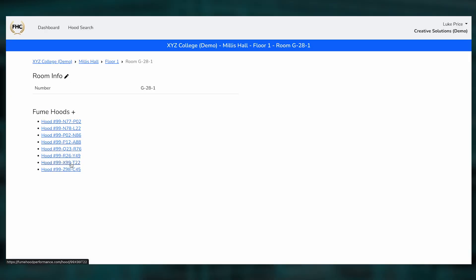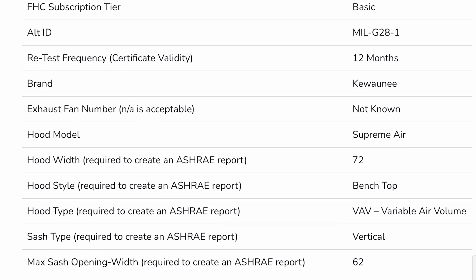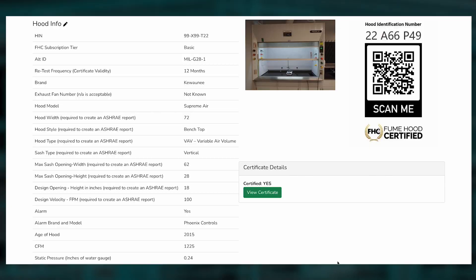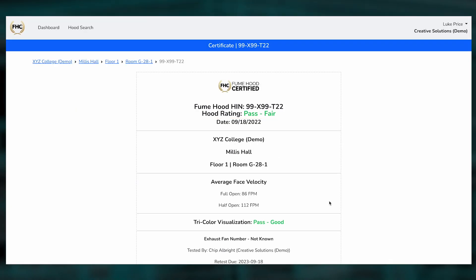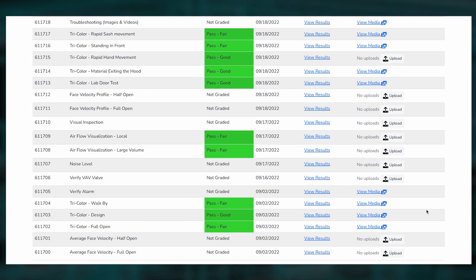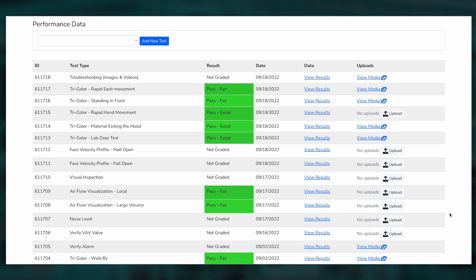Now let's look at all that you can see when you pull up a fume hood in your system. You can automatically see information like photos of the hood, hood identification number, retest frequency, hood manufacturer, size, specs, and more. You can also view that hood's safety certificate showing if it passed or failed its performance test. Another one-of-a-kind feature is you can log the information and results of each individual performance test — for instance, the average face velocity, cross-draft tests, and other tri-color challenges are all shown right here.